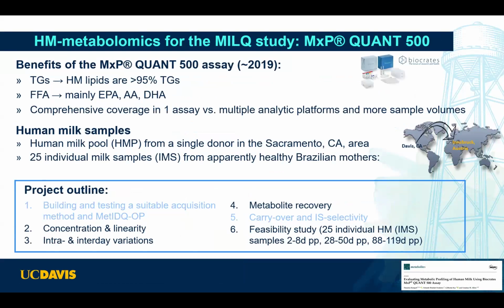So now in 2019, I think the MxP Quant 500 assay was finally available. We were, of course, not ready yet to analyze anything given just the size of the study. Samples need to be collected.